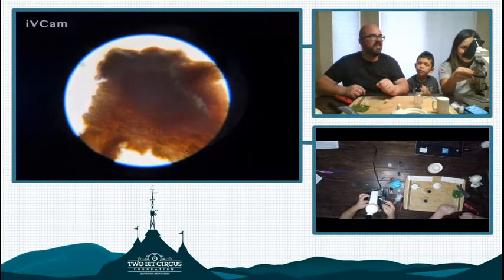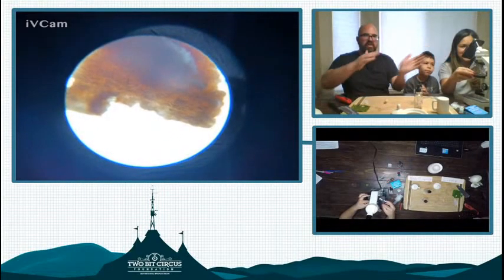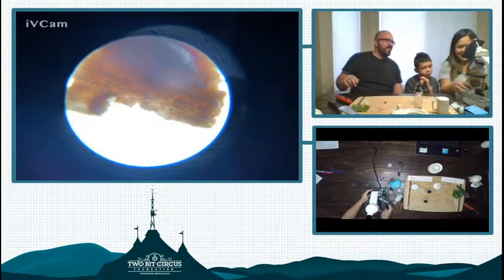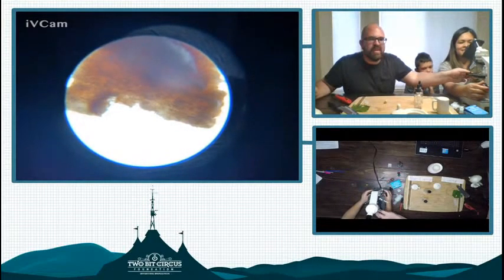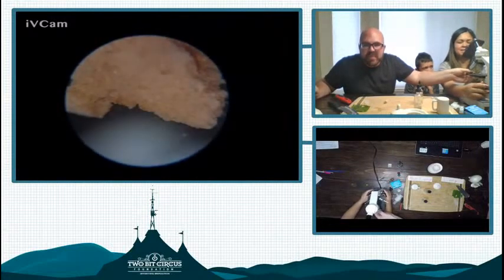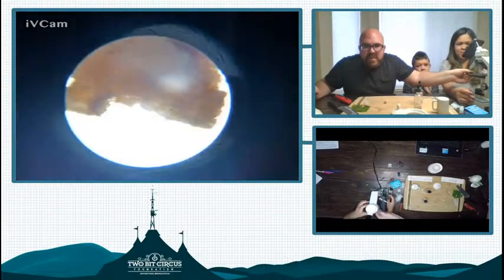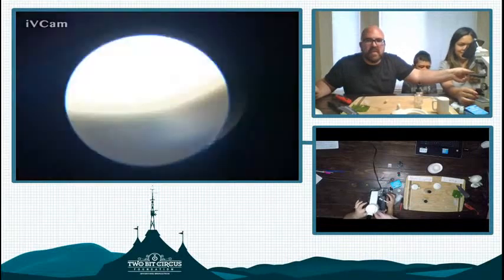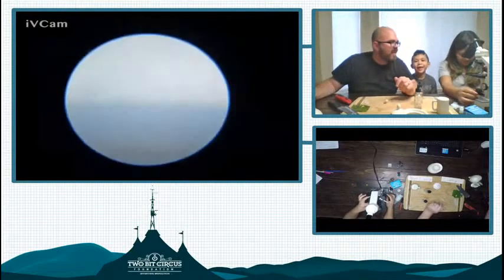I hate how it's inverted, and it's not only inverted, but also the camera is shifted and rotated. So it's inverted in a weird way, twice. Even your normal inversion isn't going to work. Usually I tell my students to move it opposite. If you need to move it up, it looks like it moves down. Let's see. It looks like the moon. Changing two things at once. It looks like a crescent.